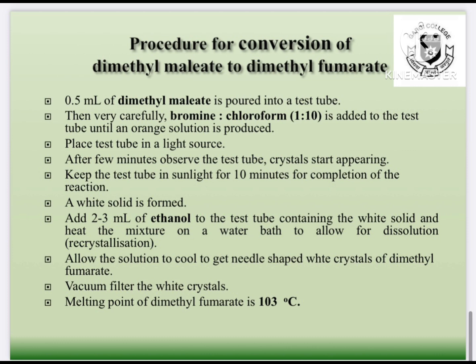0.5 ml of dimethyl maleate is poured into a test tube. Then bromine-chloroform solution was added to it to get an orange solution. The test tube was placed in sunlight.